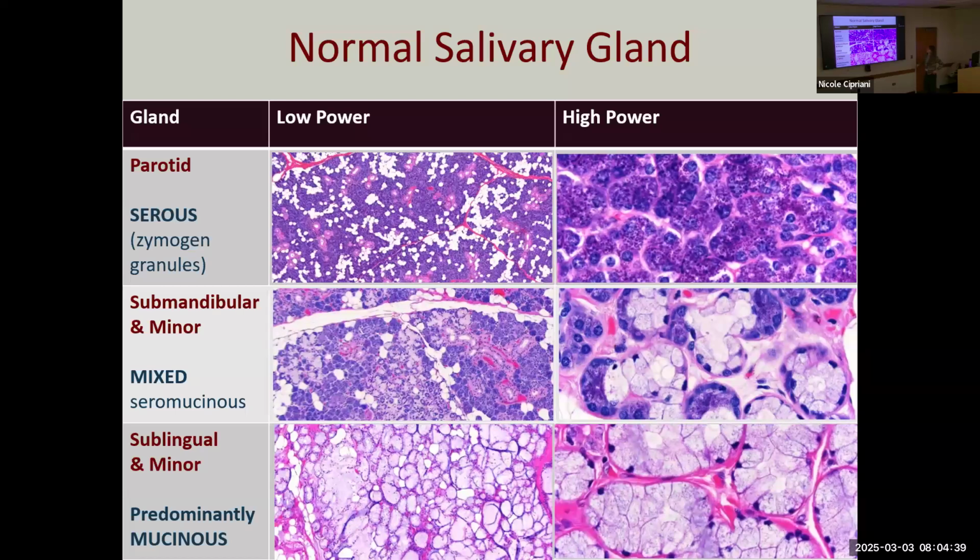As a reminder, the serous acini have zymogen granules in them, which contain the digestive enzyme precursors, right, that get excreted and then activated by cleavage. The mucinous have essentially entirely mucin, which serves for lubrication. And then you can see how the mixed ones have sort of half serous, half mucinous. You may hear the word demilune in your histology textbooks, right? So sort of half moon or part moon, because of the way that these acini have these mixed shapes.